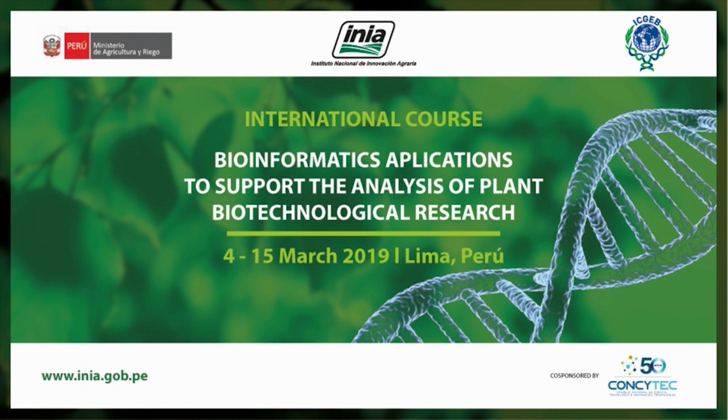There are 3 main formats. From these 3, we're going to just be looking at GFF. In the practice, you're going to see how we can transform GFF format into GTF format, and then I'm also going to quickly describe the BED format because it's the simplest one. The BED format just requires 3, well, worst case scenario 4 columns, but it could have up to 11. The essential is to have 3.